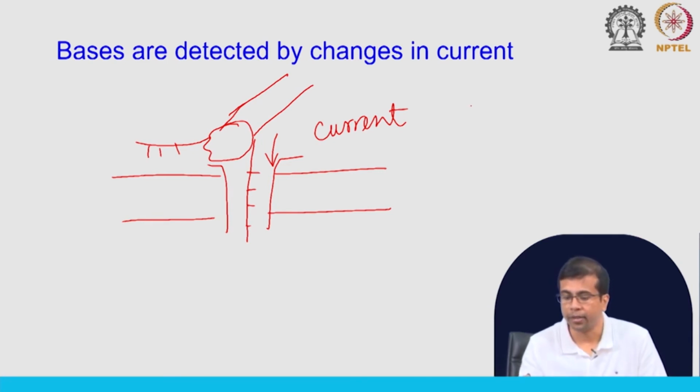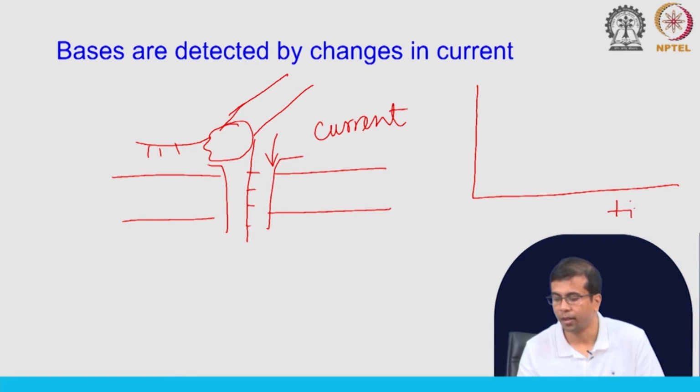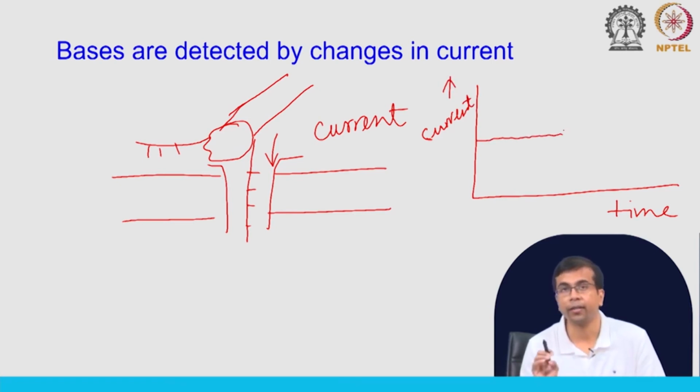Okay. So, you can imagine this situation. If you are drawing this time versus current, the y axis is current, this is in picoampere. So, very small current. Let us say we have this kind of constant level of current that is passing through the nanopore, and then at this point we start passing the DNA molecule through the nanopore.